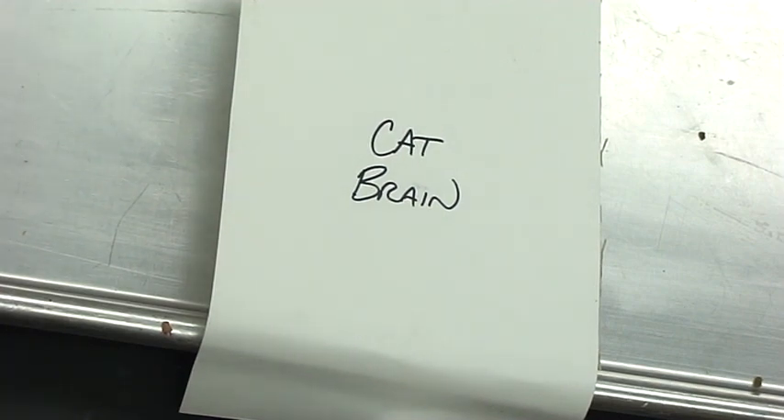Let's take a look at some cat brain anatomy. How I prefer to get the brain out of the cranial cavity is actually through the roof of the mouth. I found it's a lot easier — you get a lot less damage to the brain itself rather than the traditional approach of going through the top of the skull with the saw and things like that. Students tend to struggle with that a little bit more.